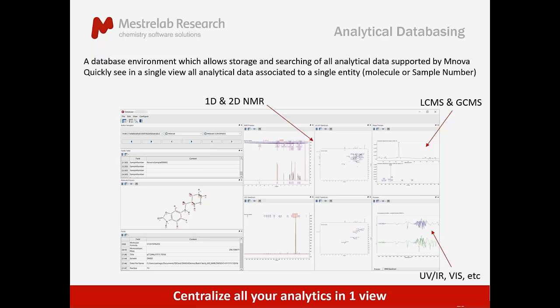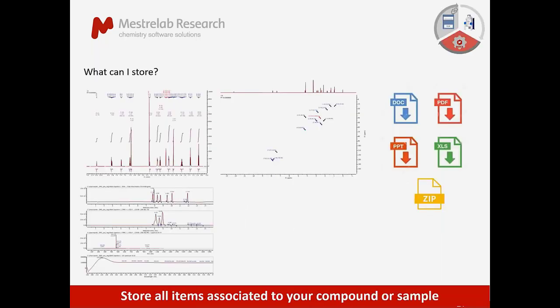So here for this structure, for example, I can see that I have proton NMR, I have some optical spectroscopy, I have LCMS, and I also have some carbon and some 2D NMRs, okay? So you can imagine maybe just by running a quick search from something else, I actually find that I have a full characterization data set for something very similar.